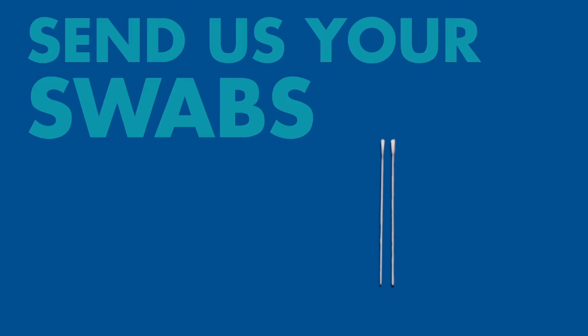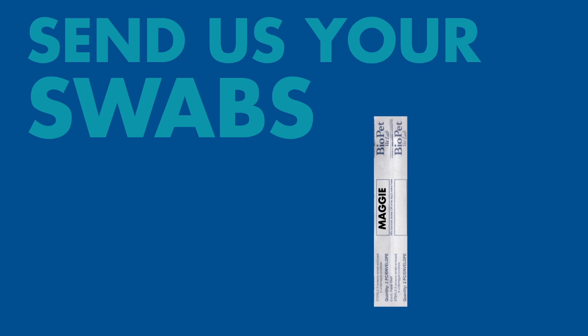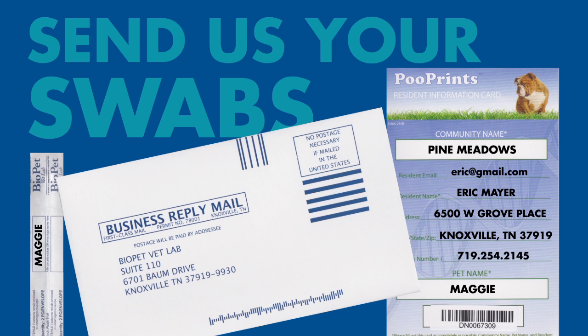Now back to the swabs. Once they're dry, place them back in the sleeve and make sure the dog's name is included on that sleeve. Put the swabs and information card in the envelope and send to the lab for processing.